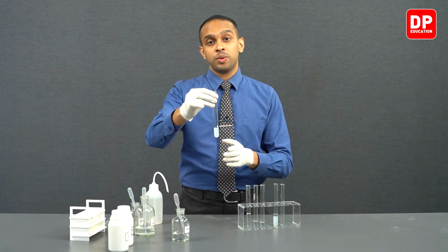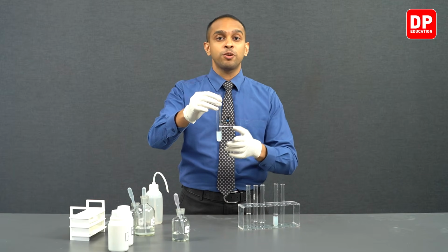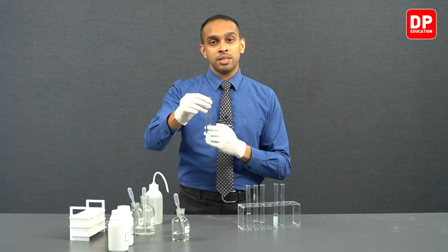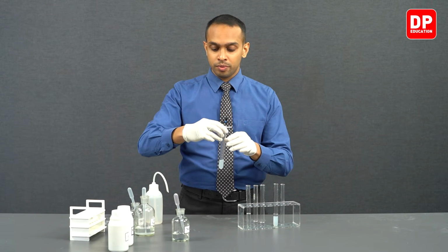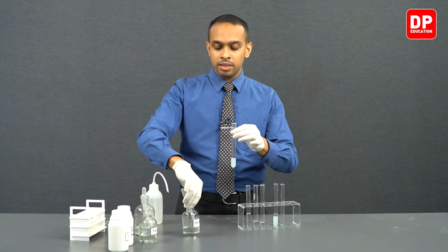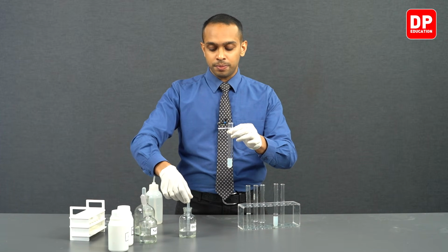And to test whether magnesium hydroxide is an amphoteric hydroxide, we are going to first add it with HCl. So let's observe whether magnesium hydroxide dissolves in hydrochloric acid.